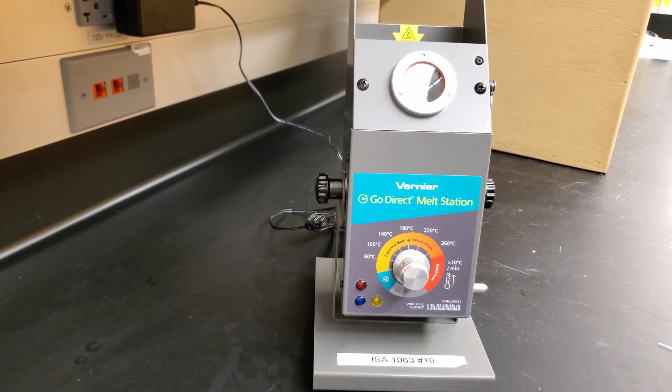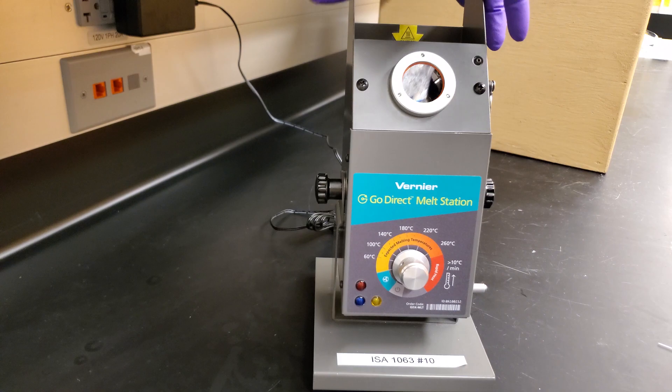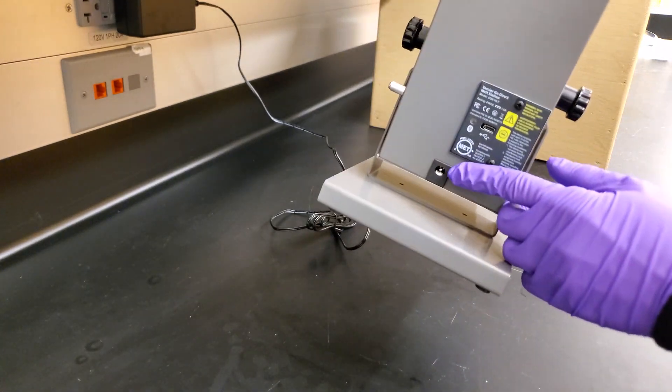Let's get familiar with all parts of the apparatus. Gloves and goggles should always be used when handling and using the melting point. All of our melting points are assigned to specific workstations and come with a power cord, which is plugged into the back.